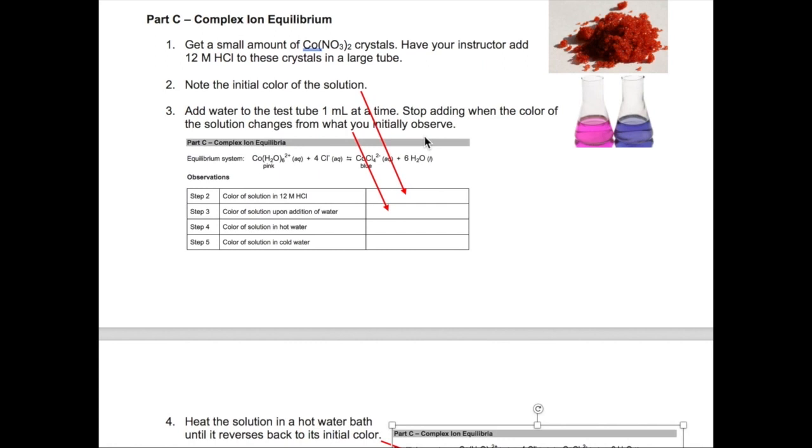Okay, now we get on to Part C. So, in this part, you must generate your complex ion solution first. To do this, use a scoopula to get a very small amount of the cobalt nitrate crystals, which has this reddish color. Then, ask your instructor to add 12 molar HCl to the crystal in a large test tube. Record the color in the first row of Part C of your lab report.